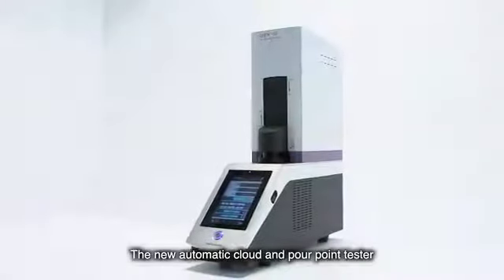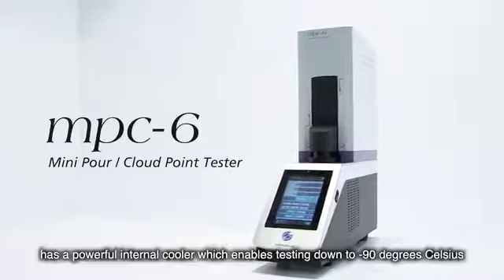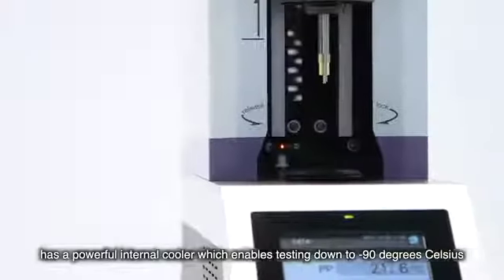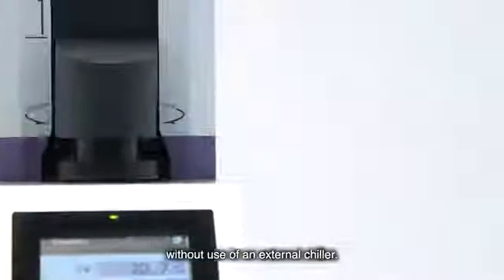The new automatic cloud and pour point tester, model MPC-6, has a powerful internal cooler which enables testing down to minus 90 degrees Celsius without use of an external chiller.